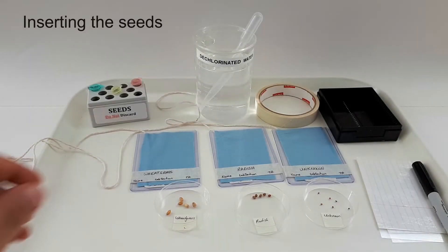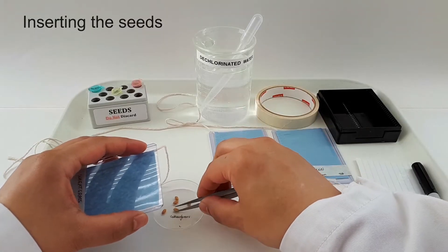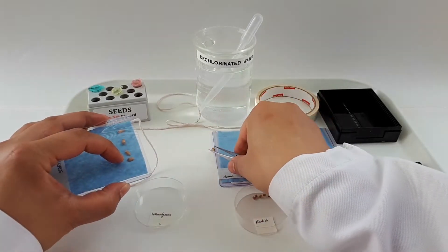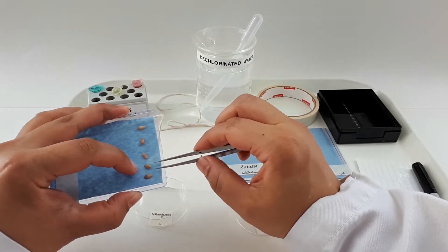Using forceps, place five to six seeds in each plant pocket. The seeds should be placed approximately one centimeter from the top of the plant pocket.